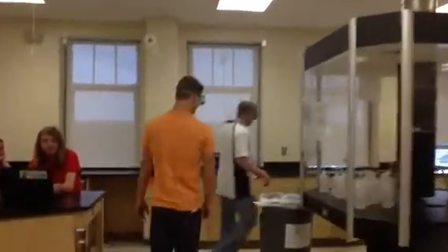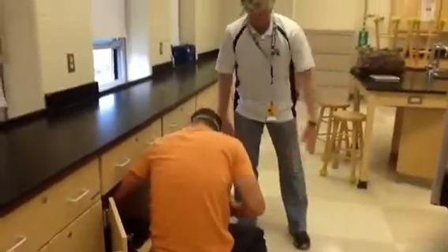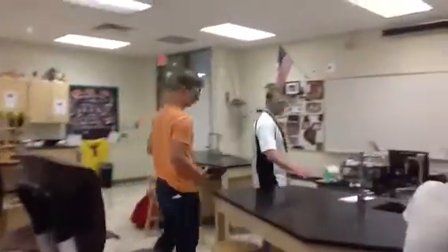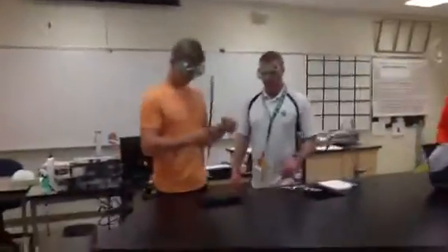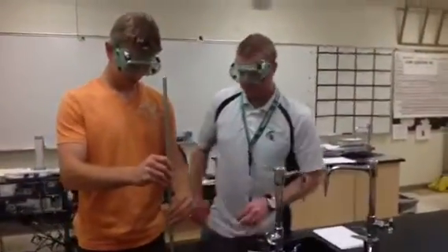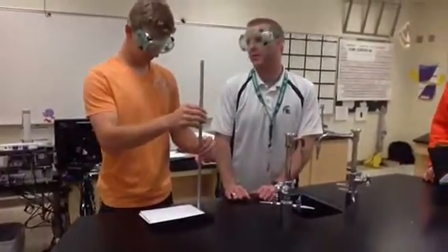We've got to gather our things needed to do a titration. The first thing we need is a pole stand. We come to the back of the room, and in this cabinet right here he's going to find pole stands. He's going to grab one, take it to his table, and put it together. He's also going to put a white piece of paper on top of the pole stand — I'll explain why that's important later on.